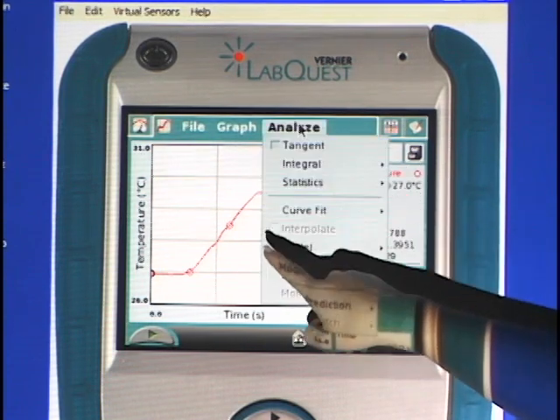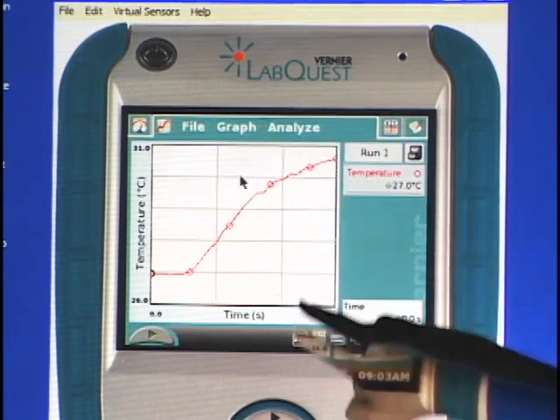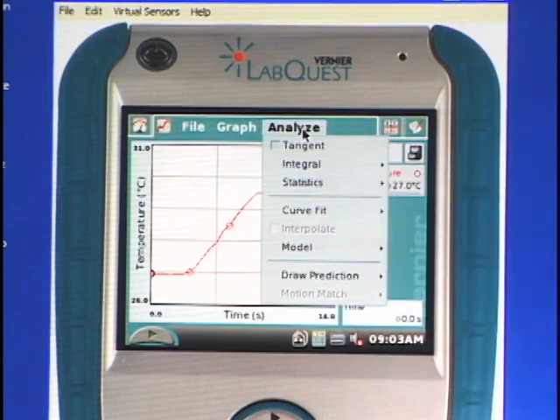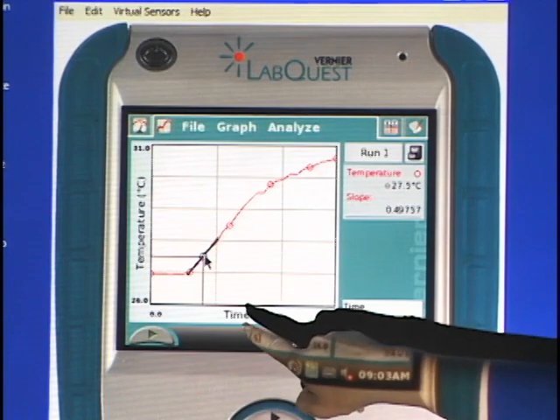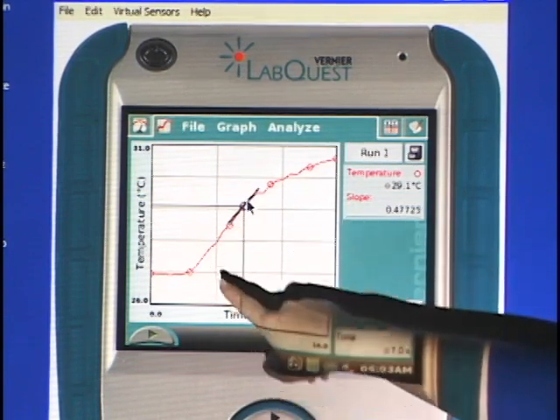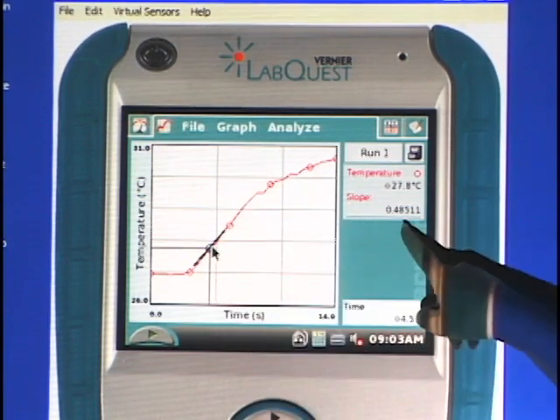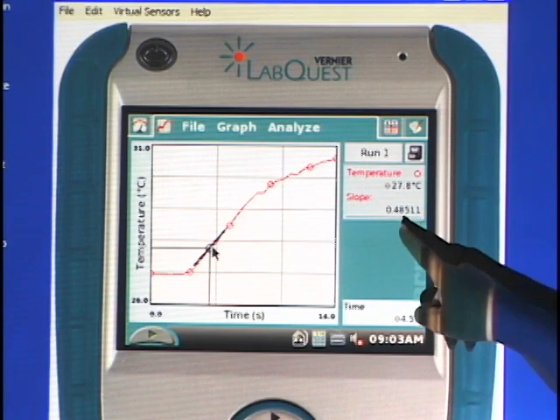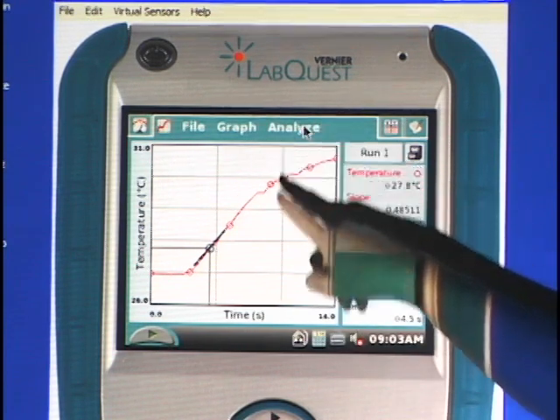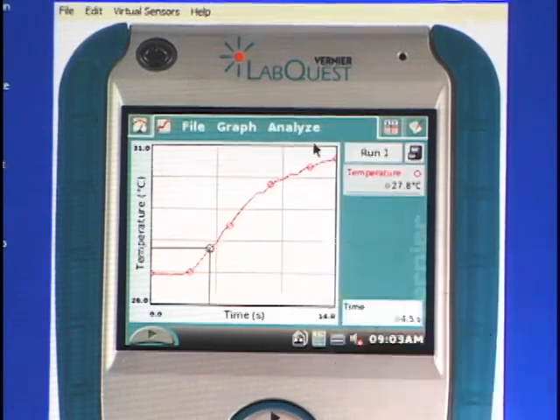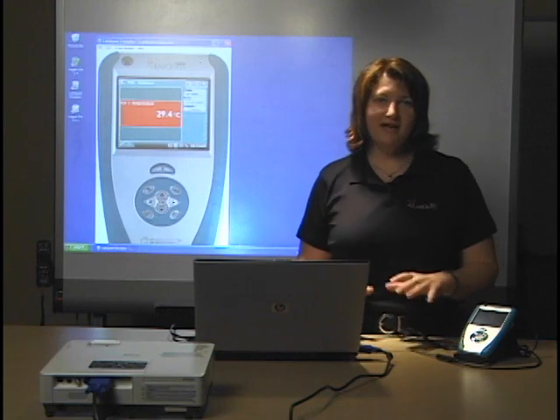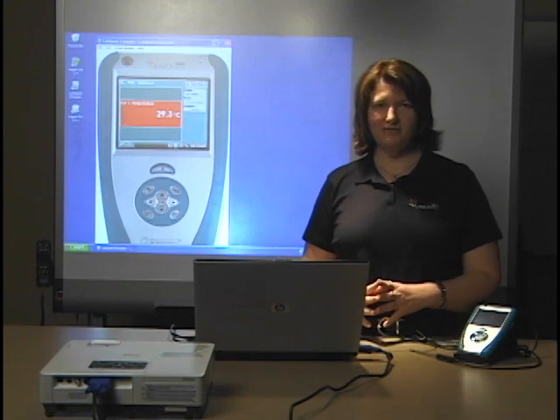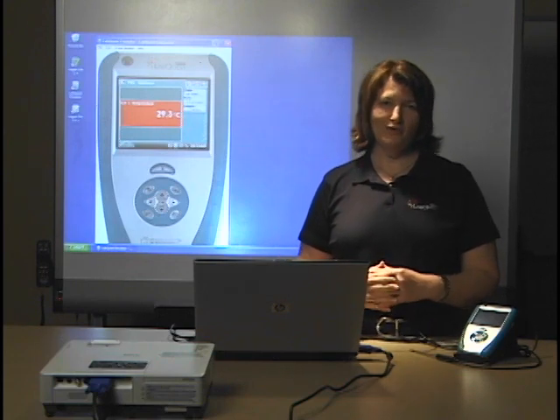I could also turn that off and do a tangent, so wherever I tap my finger there's an instantaneous slope or tangent line, and it gives me that slope right here. There are quite a few different analysis things you can do with the LabQuest emulator software. The emulator software is very nice to have and it is actually free — it comes with your LabQuest on the CD that ships, or you can download it free from our website.